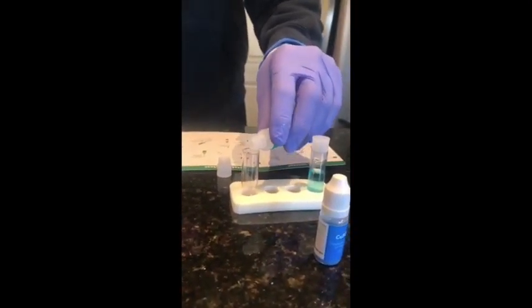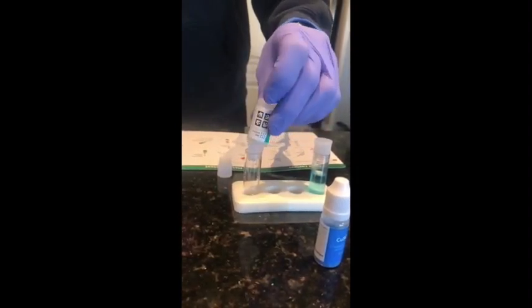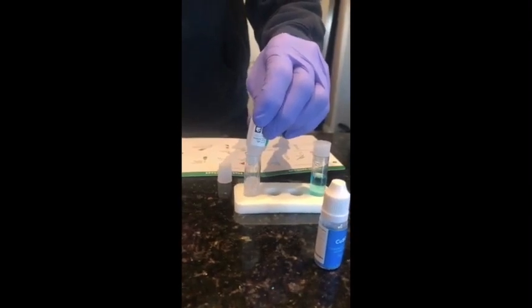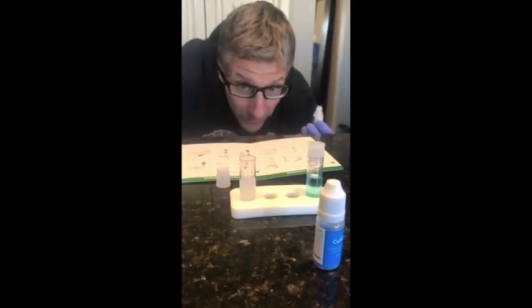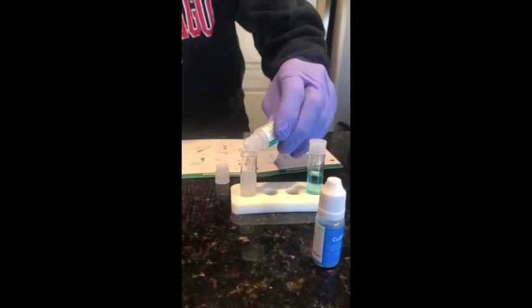And we're going to pour that in. And it's not pouring. Oh, there we go. Looks like roughly the same amount. Maybe just a little touch more. There we go.